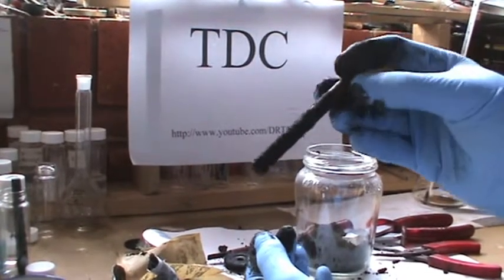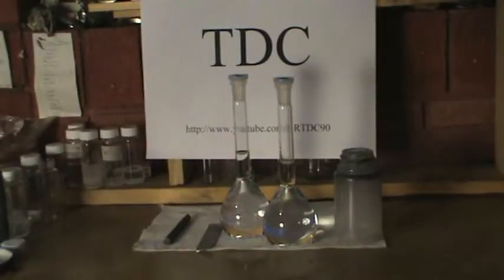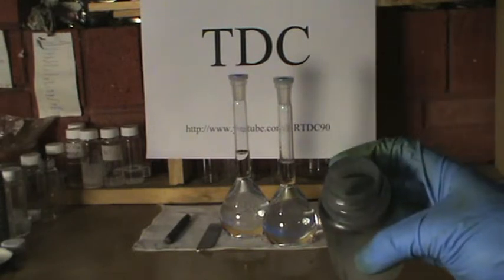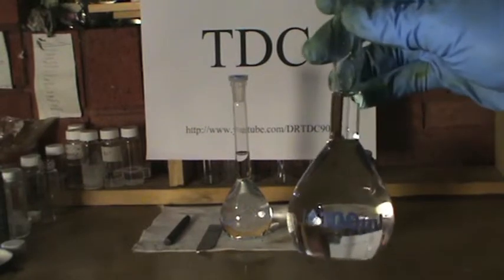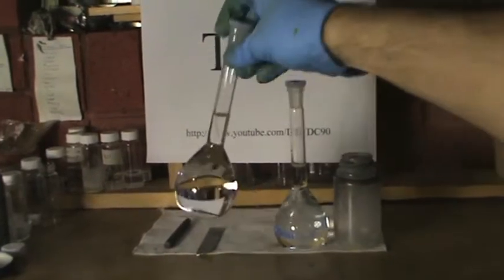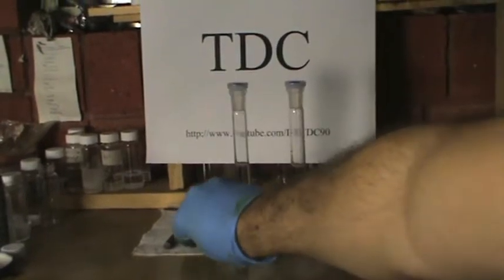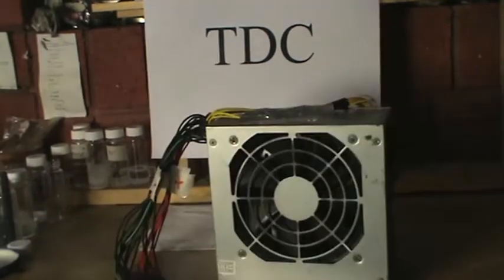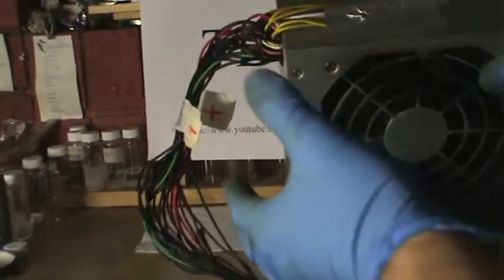Once you have retrieved the graphite electrode, wash it thoroughly with water and dry. To start the pre-treatment process we need: a container which holds a capacity of about 120 mL, a 10% volume per volume nitric acid solution, a 10% weight per volume sodium hydroxide solution, and a computer power supply unit that delivers 5 volts and 20 amps.